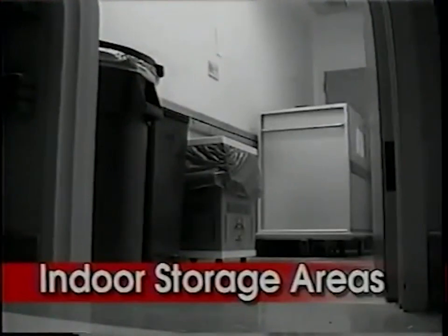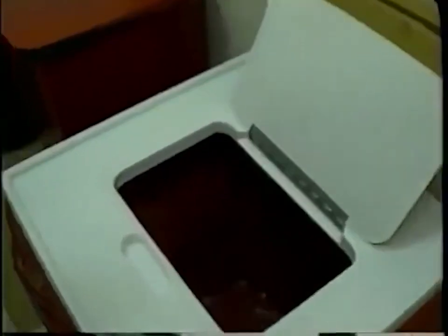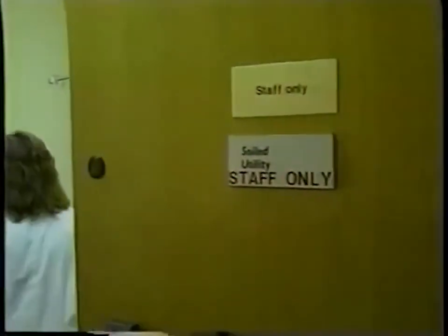All indoor biomedical waste storage areas should be restricted. What does restricted mean? Under the definition of restricted, that can either fall under 1, locked at all times, 2, a sign designating the restriction, or 3, just the location itself. The easiest way to satisfy this requirement of the code is to put some sign on the door, whether it be authorized access or employees only, designating the restriction.